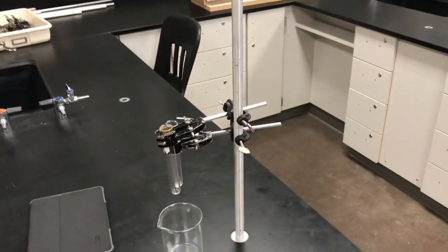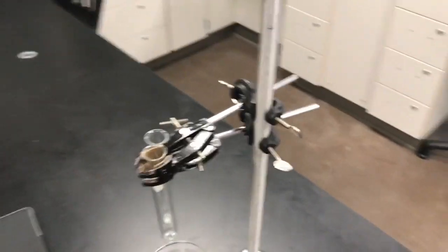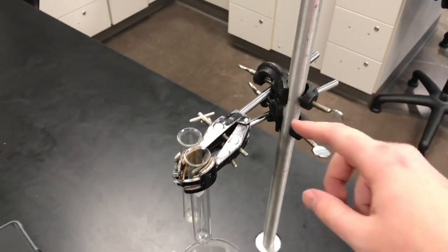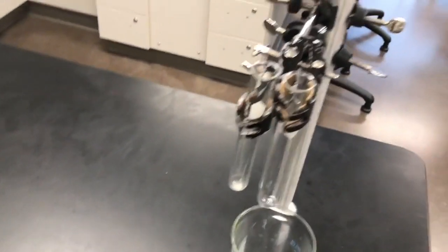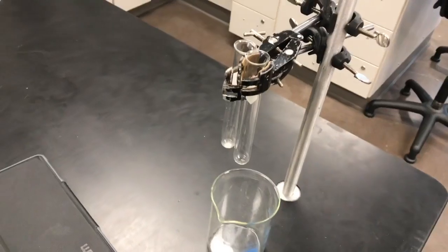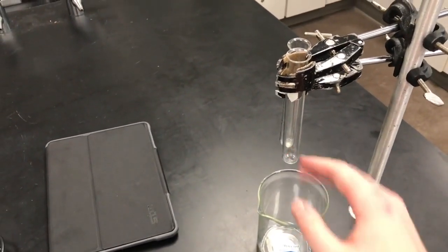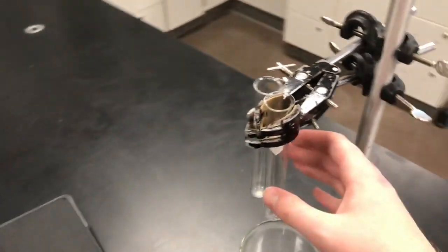We've used a lot of ring stand setups in this class before, but this time we're going to use two of them. Those are going to hold our test tubes so that they're pretty close together, because eventually we're going to be dropping both of the test tubes into the beaker at the same time. So you want them to be close enough together.